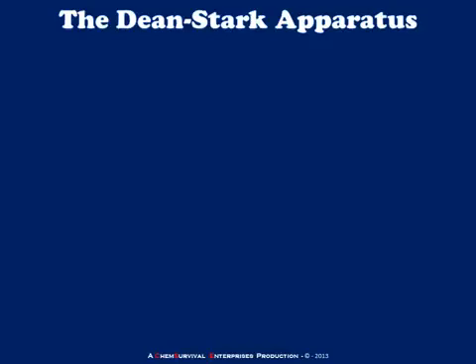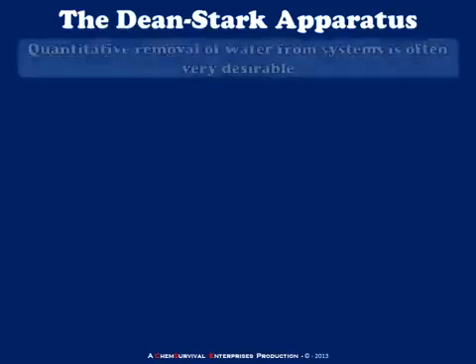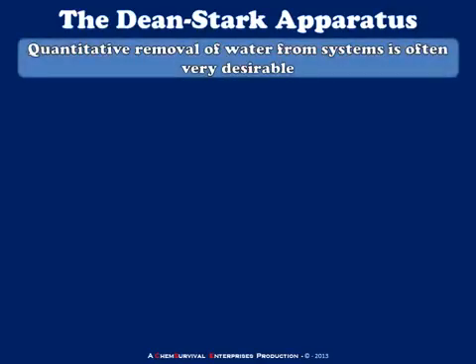Welcome to a brief introduction to the use of the Dean Stark apparatus in the organic chemistry lab. I'd like to begin by reminding you how common water is in the organic laboratory. Despite our best efforts to exclude it from many reaction setups, it's very difficult to get rid of all the water that's present in certain organic solvents and mixtures.